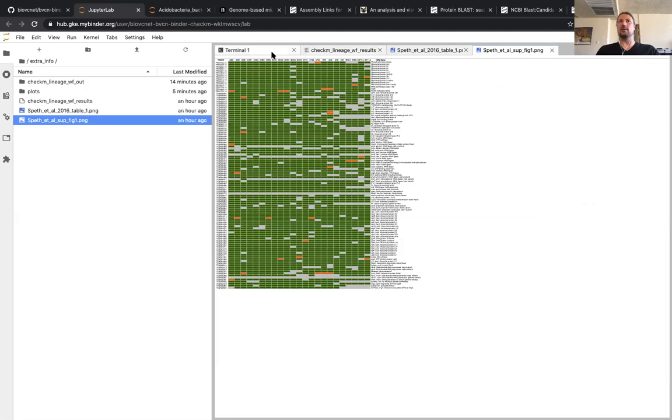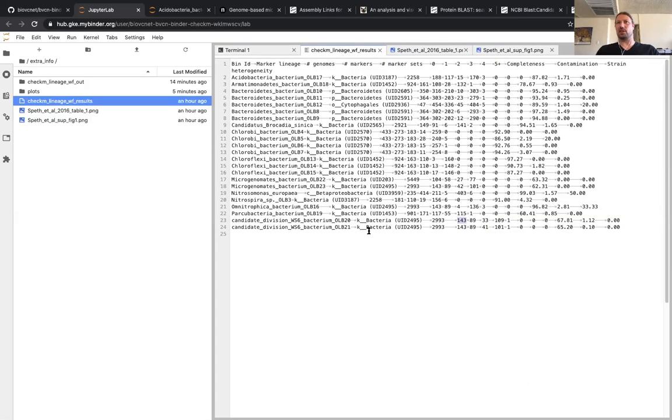We'll see that the results here, 67, 65, are on the very low end, even though these are genomes that are in very few pieces and are relatively high quality. And this is because some lineages lack large quantities of marker genes.